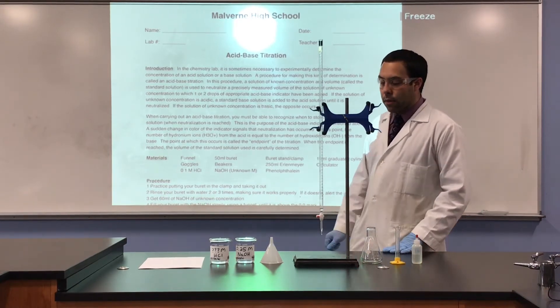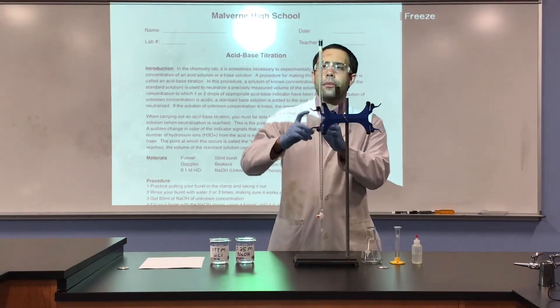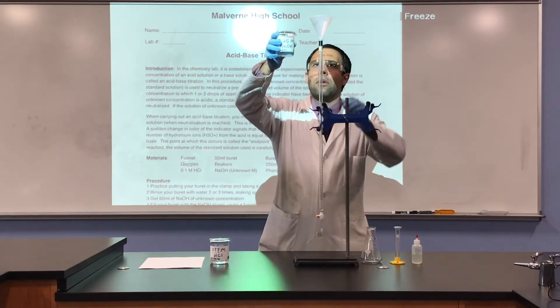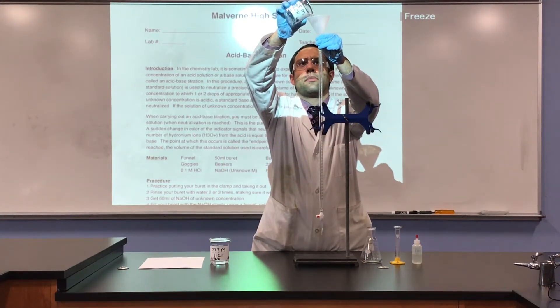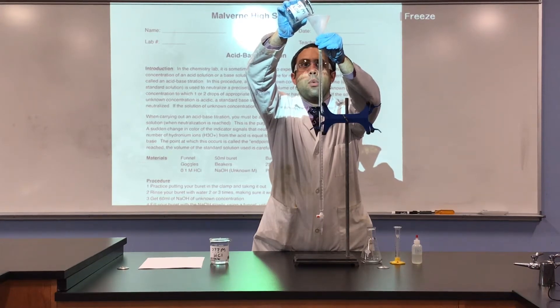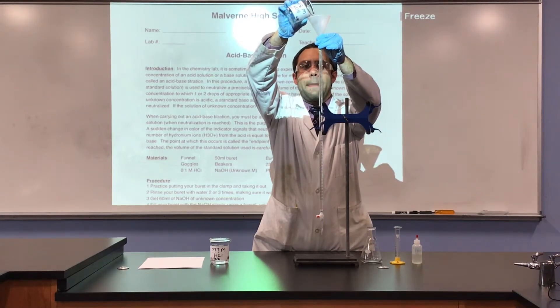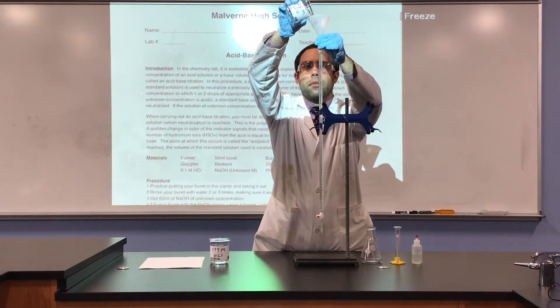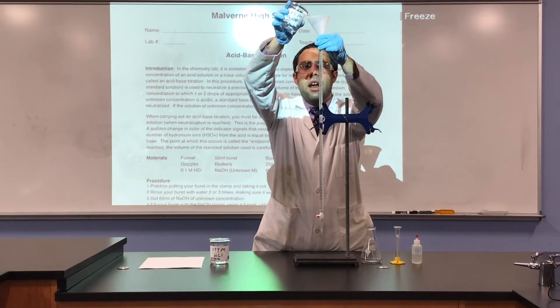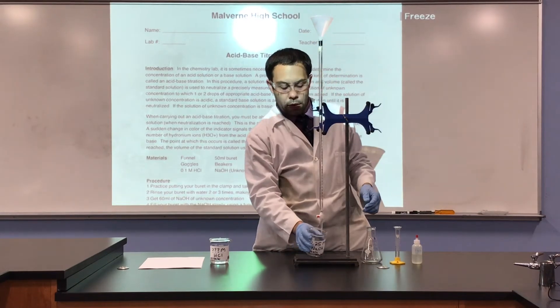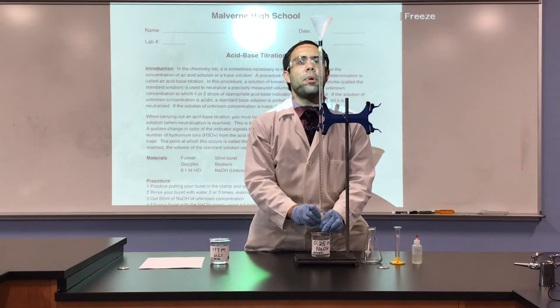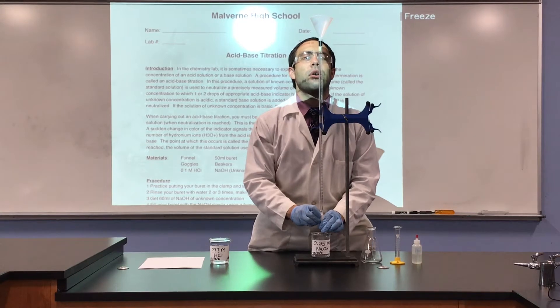Let's set up. We'll take the funnel, put it on top of the burette, and fill the burette with base. We'll fill it up all the way past the zero mark. But be careful not to overflow it. But then, we'll slowly open the stopcock to bring the base level down to zero milliliters, our starting point.